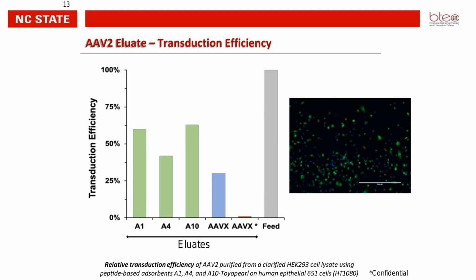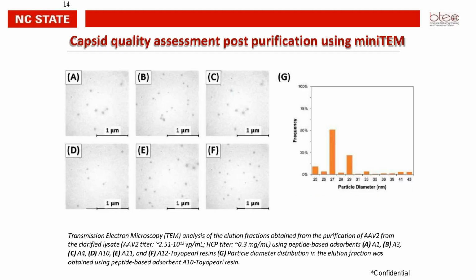So all we basically understood was that keeping the capsids happy at neutral pH environment is the way to go. To keep the capsids happy here, we also wanted to look into the quality of the capsids just to make sure they are not fragmented or they are all intact, not forming aggregates and so on.